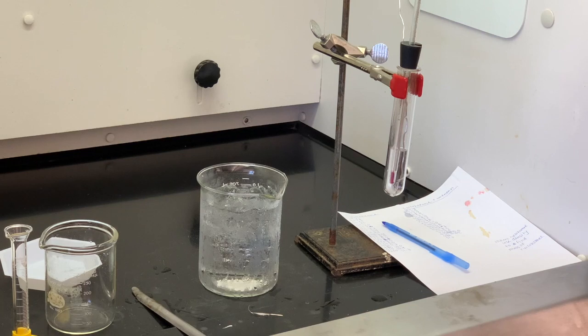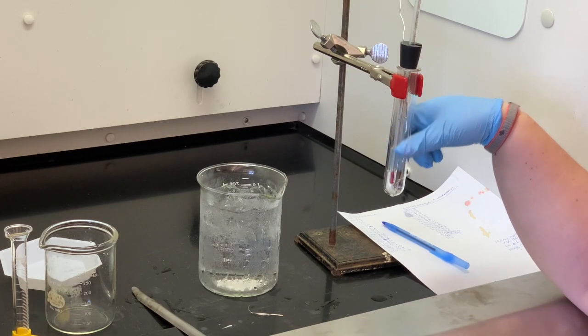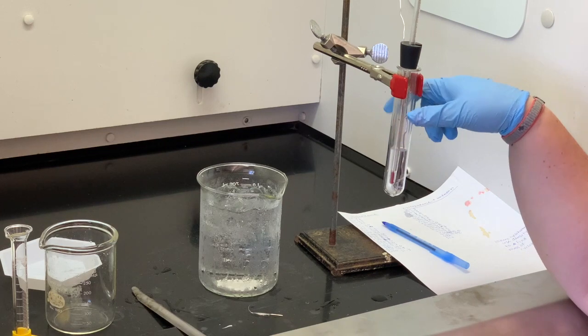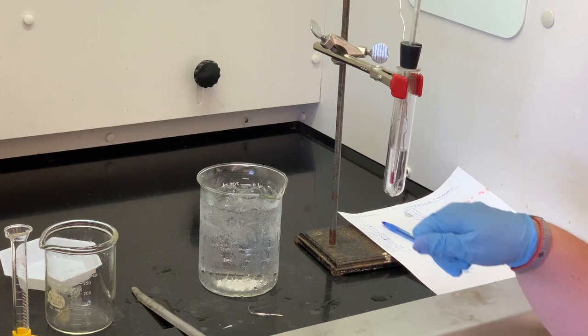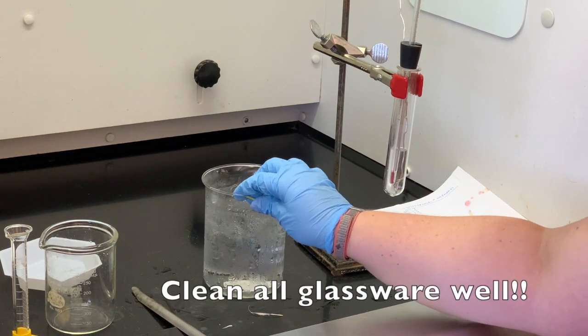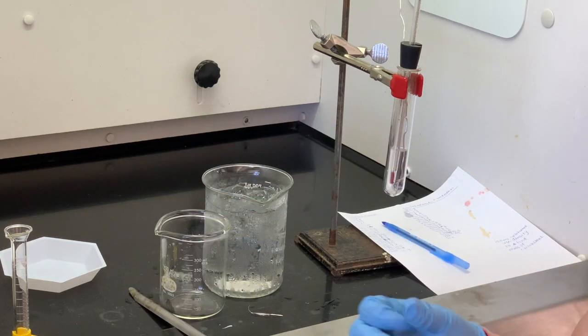This is the end of the procedure. What you need to do now is put the waste into the flammable waste container. Make sure you carefully clean all of your glassware, especially the beaker that has salt water in it, because if that dries out it's going to leave a lot of residue. Make sure that you always wash your glassware so that it is actually clean.